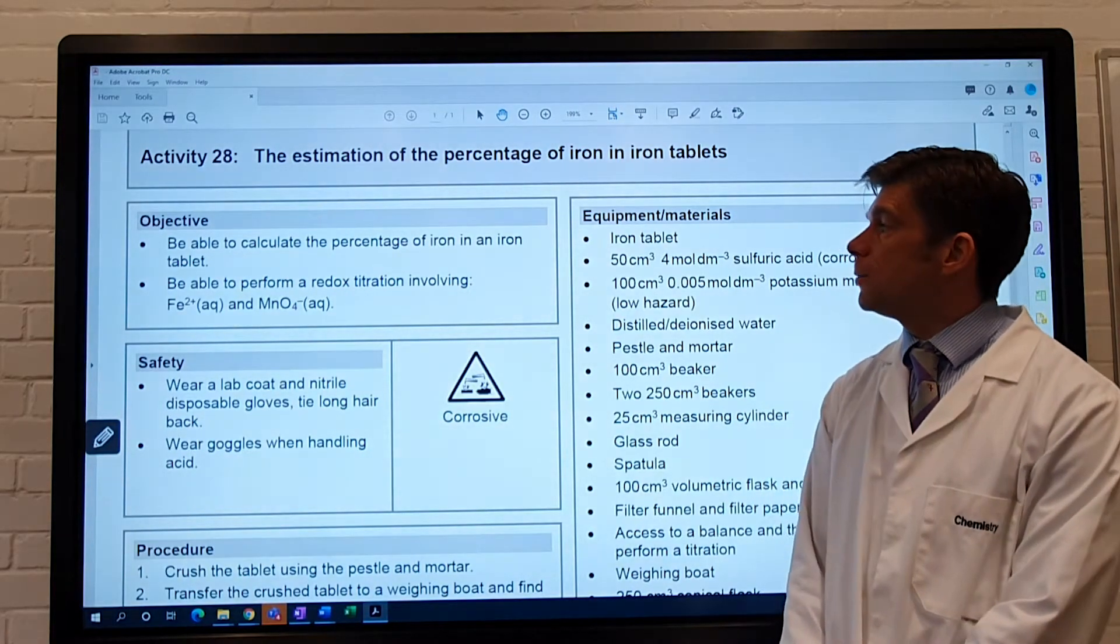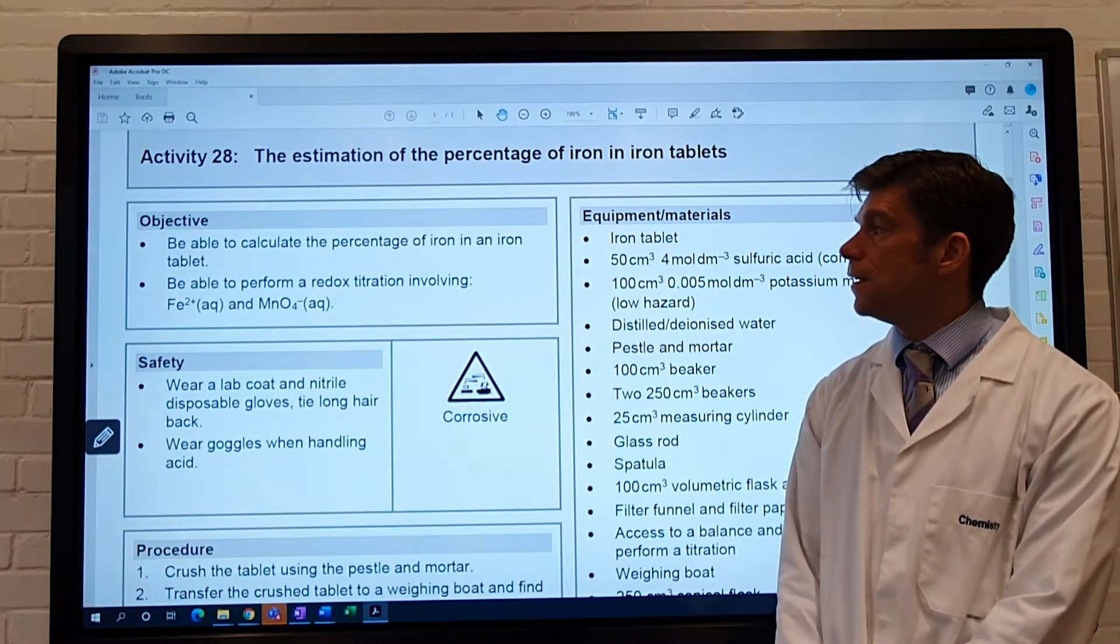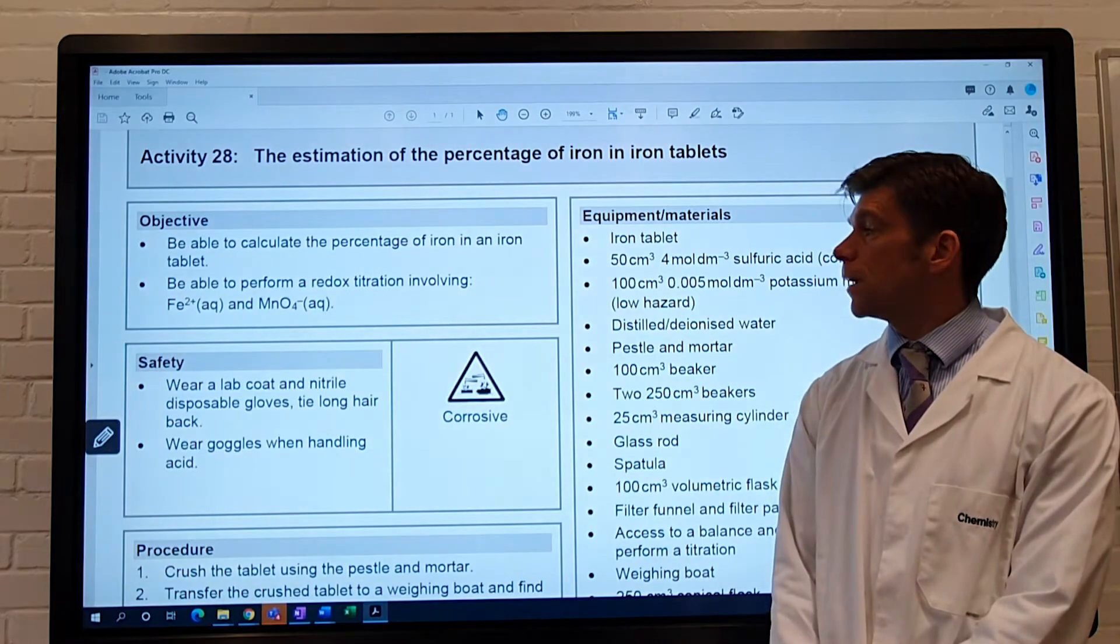The aim of the experiment is to be able to calculate the percentage of iron in an iron tablet, and to perform a redox titration involving iron 2 plus and the manganate 7 ion.